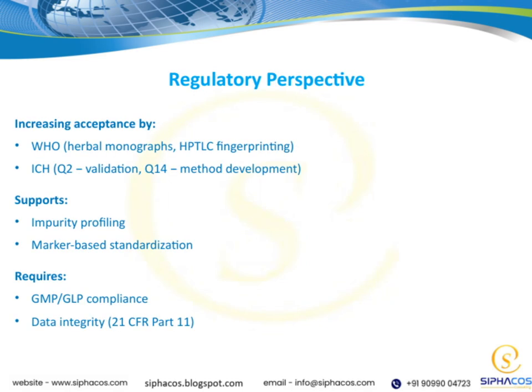Let's take a look at the regulatory perspective on herbal analysis. We're seeing increasing acceptance from major organizations like the WHO, which now includes herbal monographs and uses techniques such as HPTLC fingerprinting to ensure quality and authenticity. Similarly, the ICH has developed guidelines like Q2 for validation and Q14 for method development, which are becoming essential for standardizing analytical procedures across the industry. These regulatory frameworks support important aspects like impurity profiling, helping us identify and control unwanted substances, and marker-based standardization, which ensures consistency by focusing on key compounds.